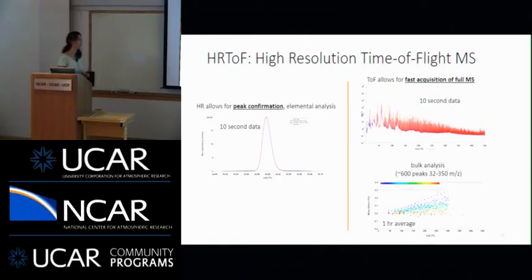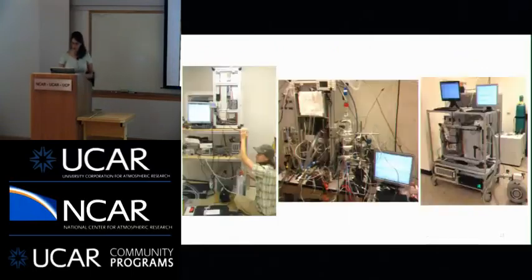And that's really turned out to be a non-trivial problem because we get a vast amount of data. We get full mass spectra with high resolution, so we can, again, figure out the different elemental compositions, and we get that very quickly. So the real challenge here is taking the data and then understanding what it means and what we're measuring. So that is the struggle.